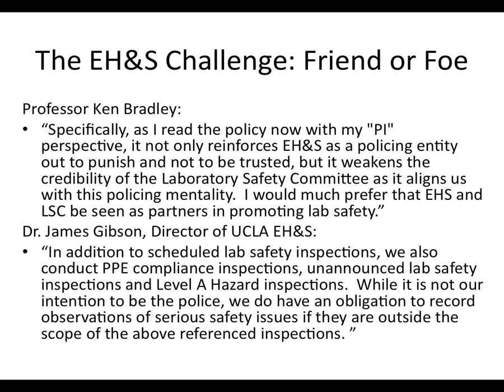Okay, this was something that was sent out by James Gibson, director of UCLA EH&S, a different perspective. In addition to scheduled lab safety inspections, we also conduct PPE compliance inspections, unannounced lab safety inspections, and level A hazard inspections. While it is not our intention to be the police, we do have an obligation to record observations of serious safety issues if they are outside the scope of the above referenced inspections. What this means is that the EH&S inspectors cannot be used as consulting experts. They come into the lab, they see something, they write it up. And so this is the challenge that I think EH&S people around the system need to work as hard as they can to be colleagues in safety compliance, although recognizing their role of inspecting and holding labs to certain standards.